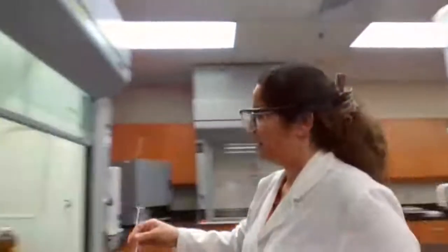45.815 minus the empty graduated cylinder was 37.862, and based on this we can find the mass for 10 milliliters of unknown liquid, in grams. So if you have the mass and you have the volume, we can calculate the density. I'm going to place it back in the fume hood so I don't have to inhale the chemical. That was unknown A, because it's going to ask you which unknown you are using.